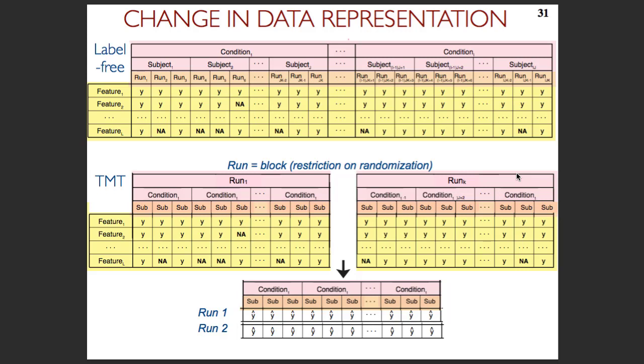But in many cases, and even, by the way, in DIA, the fold changes are not accurate, because also you hit the limit of the dynamic range. So there are many reasons why fold changes are distorted. But for many applications, it may be enough as long as we find that there is a change in abundance. And I think this trying to get the fold changes right is probably motivated by the fold change cutoffs, which in my view is a really wrong approach statistically altogether.